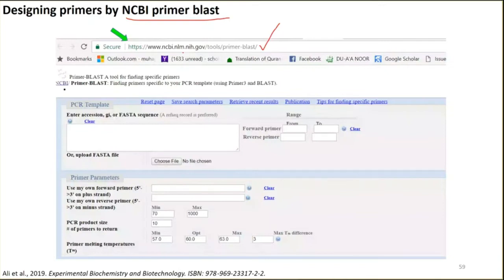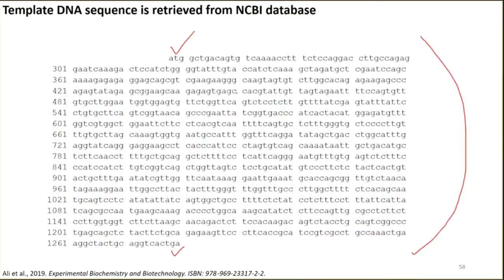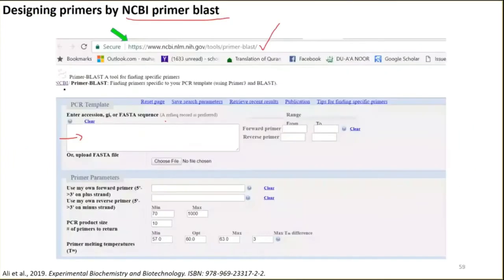Okay, so we will copy this whole sequence and paste it in this blank window. So this website is opened. And I will try to share the video recording of this lecture on the website, and you can follow the simple steps for the designing of your own primer. I will try to make sure of the recording and the sharing on the YouTube channel or somewhere.